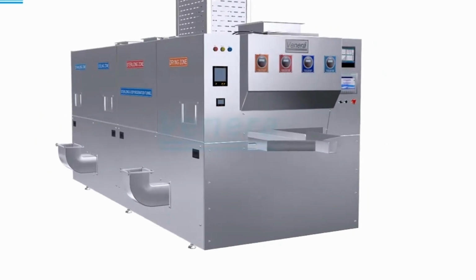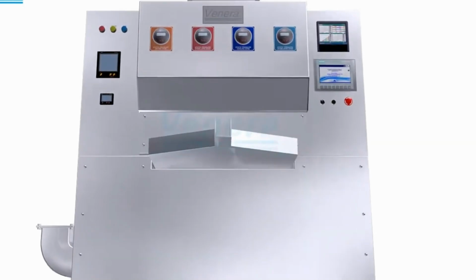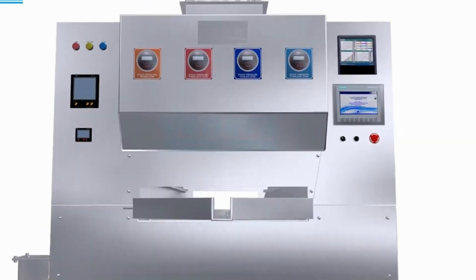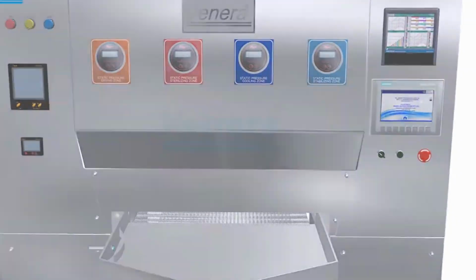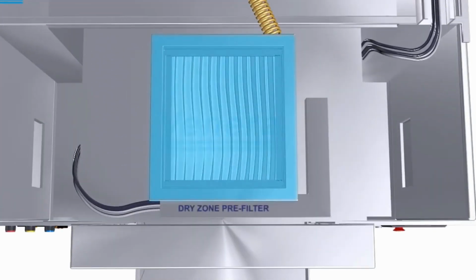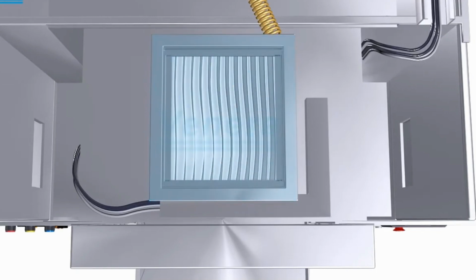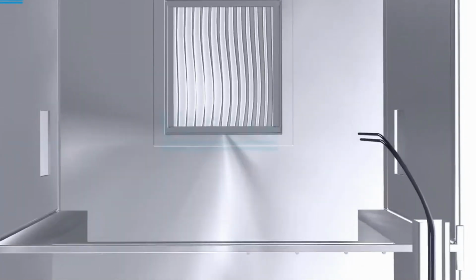Heating zone, hot zone. The containers pass through the preheating zone, where their temperature begins to rise gradually. This prevents thermal shock when entering the main heating area. The containers then enter the main heating zone, also known as the depyrogenation zone, where they are exposed to extremely high temperatures, typically ranging from 250 degrees Celsius to 300 degrees Celsius, for a defined period. The heat effectively destroys pyrogens, particularly bacterial endotoxins.